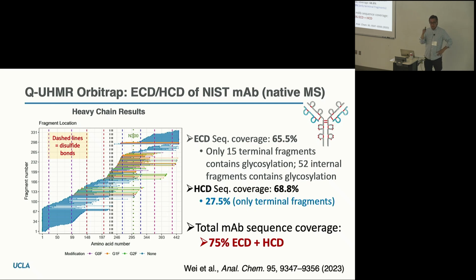One of the goals is, in pharmaceutical companies, they want to do these stress conditions. They want to take their therapeutic protein and stress it under high temperature, high oxidation states, because they want to produce a therapeutic drug that, if a doctor in Africa puts it on the windowsill of a counter and stores it there for 3 weeks, is still going to be stable. And so they want to understand where the possible modification sites on the antibody are, so they can mutate those sites out.